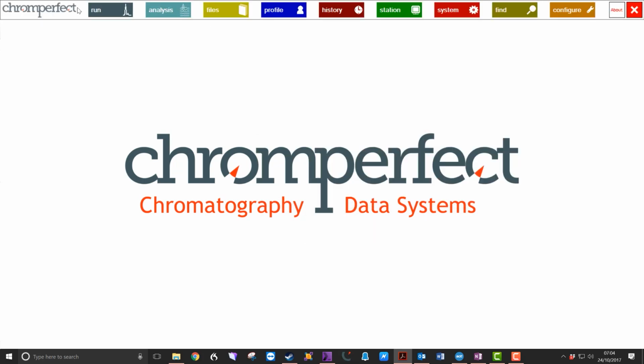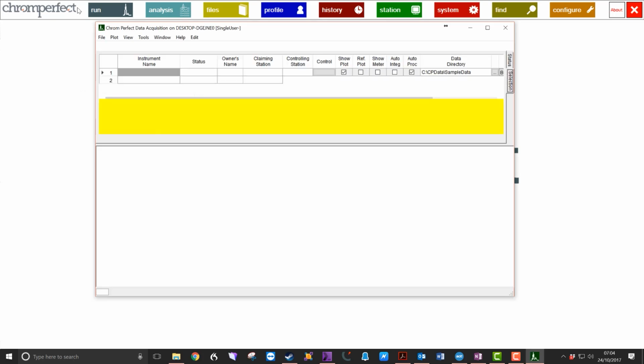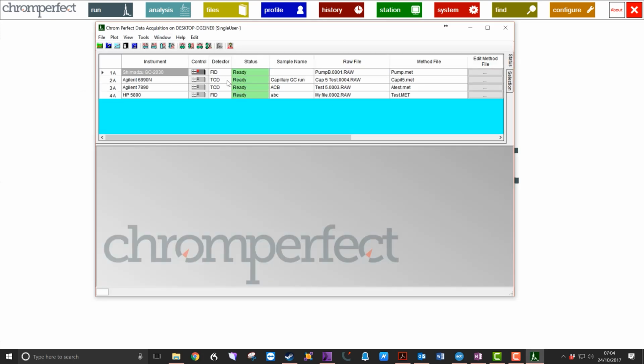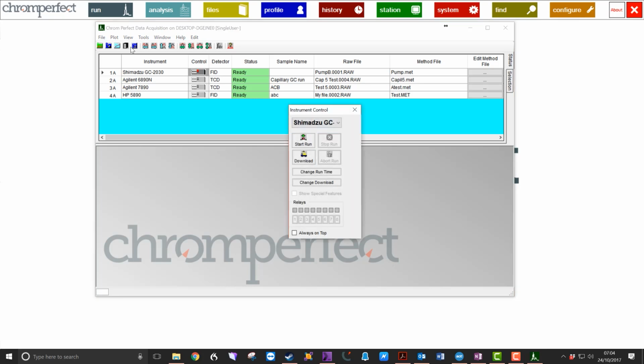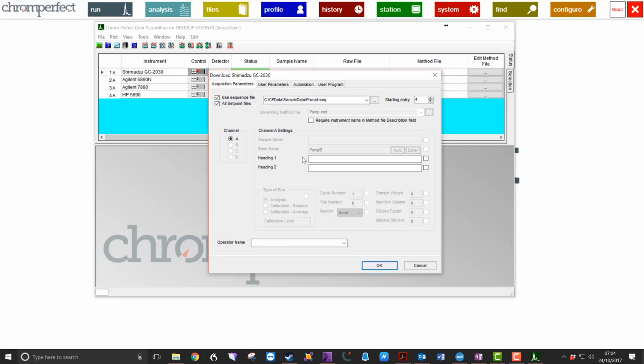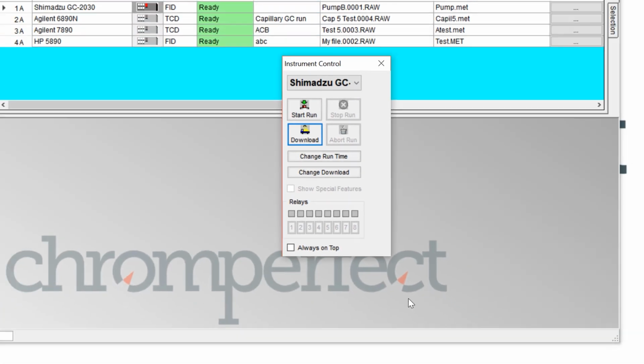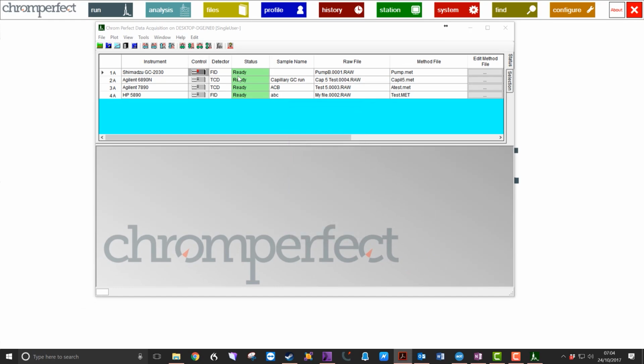The field does not appear at download time. If the checkbox is checked, then the operator field may be set at download time. The field appears in the download form as a combo box. In its simplest form, the user is free to supply any operator name, but if desired, a number of operator names may be suggested in Step 5 above.